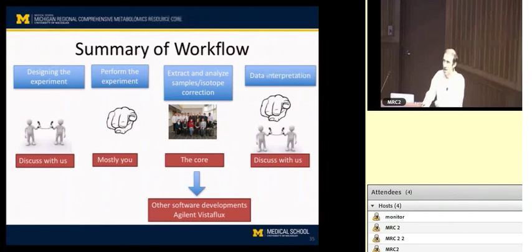Although you can't study flux from metabolite levels alone, oftentimes a change in flux will be reflected by some sort of change in the metabolite level. So you may get a hint that something's going on with a particular pathway from your untargeted analysis, and then be able to follow that up with tracers. That said, there are people who do untargeted fluxomics. It is possible. We can generate the data for you, but be very cautious when interpreting that data because it's extremely complex.